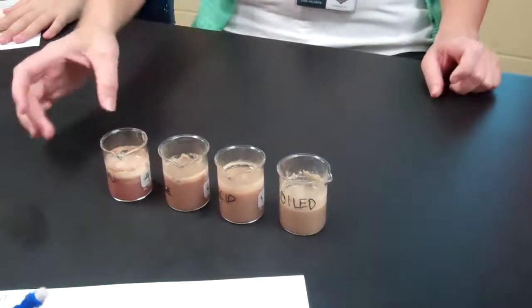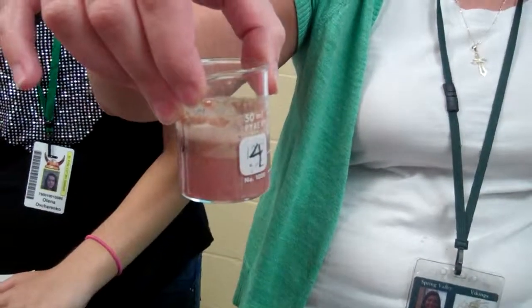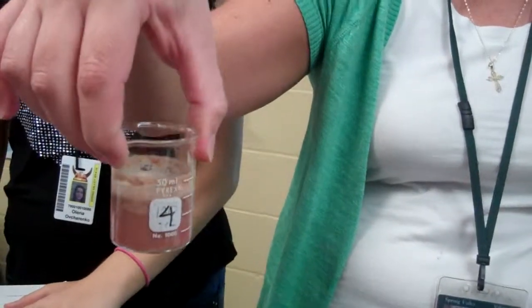Okay, and you guys can kind of look at it. It's a little bit more pink than the others. Yeah, and it smells like liver. Okay. So that's raw liver. Any guesses for why I am going to use raw liver? As a control. Very, very good answer. Clap.